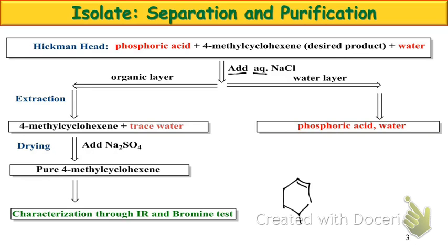Well, notice that you're not adding just an aqueous solution. You're adding an aqueous solution of sodium chloride. Why do we add the sodium chloride? Why not just add water? No, sodium chloride is just a salt. It's not really going to react with the phosphoric acid.